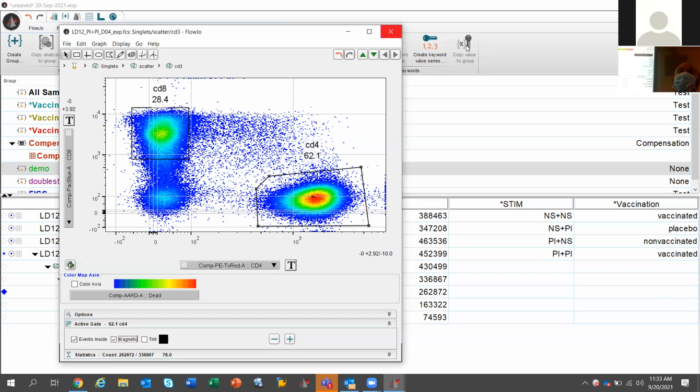I personally never do quadrant gating, or curly quadrants. One, if I need to do that, then it means that I need to do it with high parameter. Otherwise I could do other analysis with 2 gates or 1 gate. Or I could also do it with Boolean gates, and I'm going to cover that in a couple minutes. And it's far better than doing the quadrants. No problem.